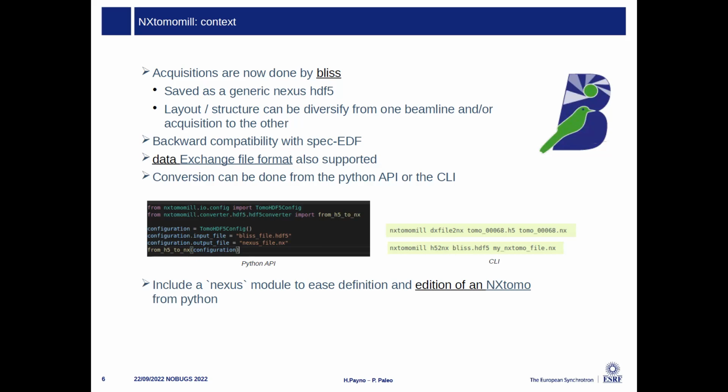The last point is regarding the data exchange file format. I guess some of you know about it. At the European Synchrotron, we have scientists who are using this file format, which is also based on HDF5, and it's the same idea. They can easily convert from the data exchange file format to NX-tomo and benefit from the software.